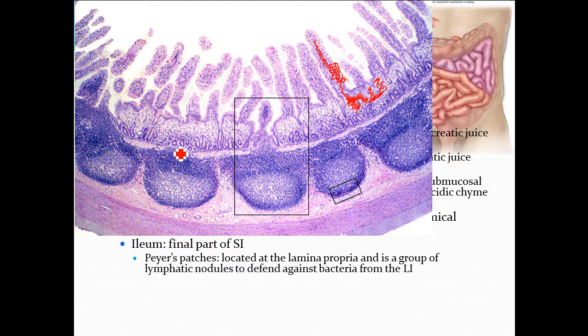Good. And what would you call this here? This smooth muscle that you see over here? Yeah, the muscularis mucosae. Okay, good. And then all collectively you have all these parts making the mucosa. Very good. What do you call these dips that go down here, that you see a little bit over here as well?